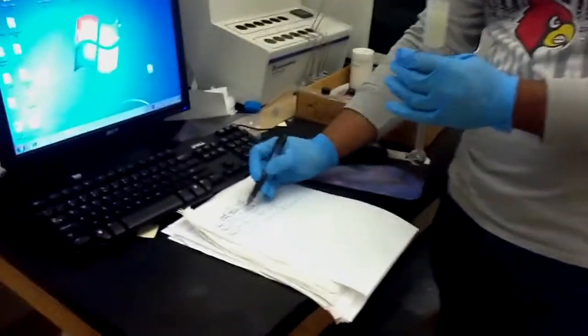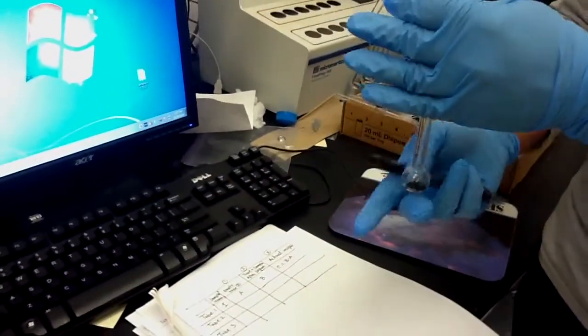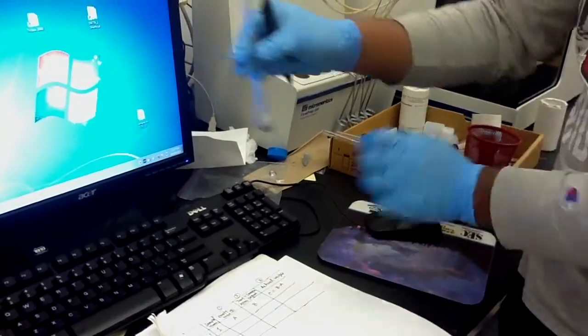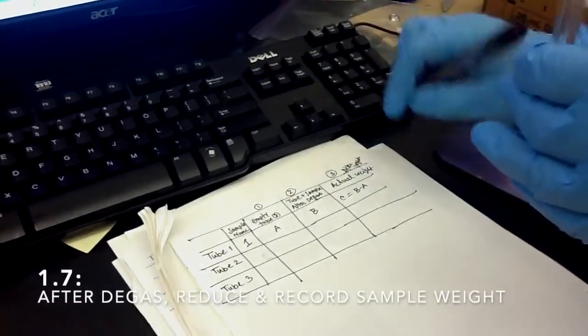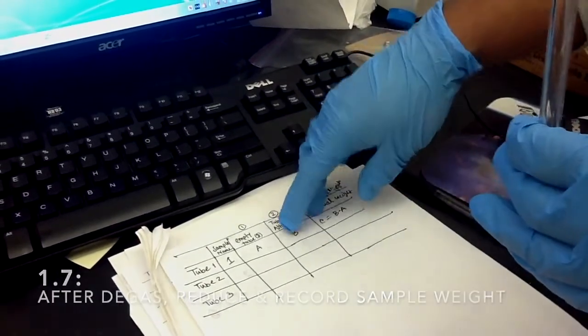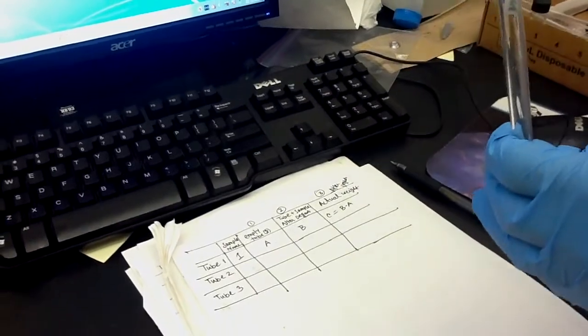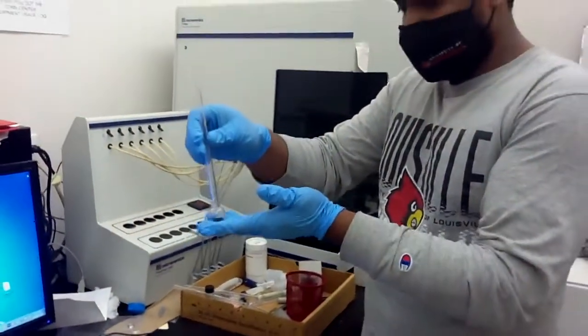Suppose your empty tube weight is A. After putting the sample inside the tube, you need to measure the whole tube again. So this weight will be B. After degassing for 2 or 3 hours, the actual weight will be B minus A. That means this is the actual weight of the material. So now, after putting the sample in the tube, I will show you how to degas it.